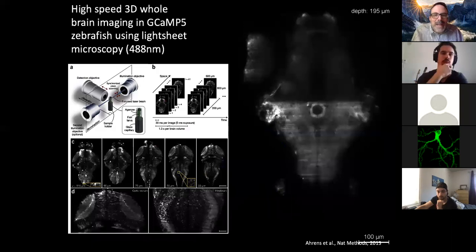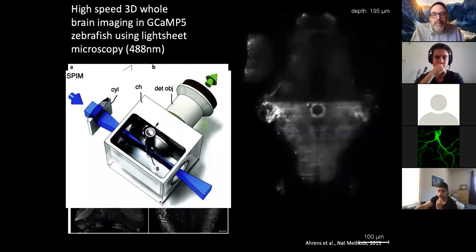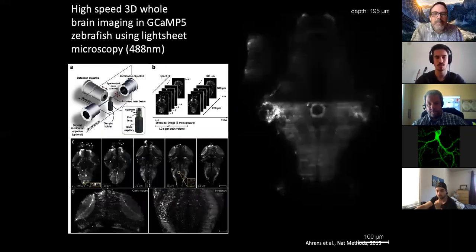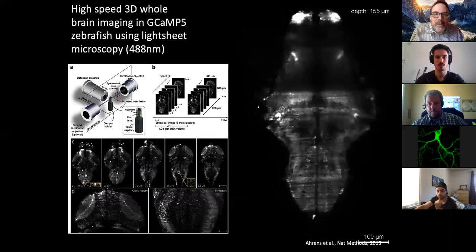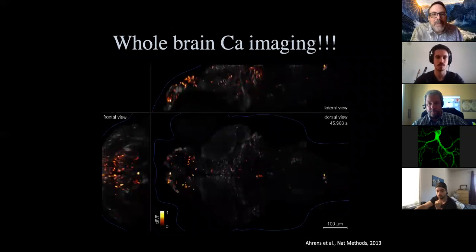And of course, the classic image, the mandatory image for a presentation on this kind of method, is the work from Misha Ahrens, doing whole brain light sheet imaging of GCaMP. I think one of the greatest advantages of a transparent model like this is that you really can do whole brain imaging at high temporal resolution. And I really like some of the other approaches that I heard about, the high-low approach, for example, that you guys are doing. Sounds really cool. Rapidly scanning through the brain and generating nice three-dimensional reconstructions of activity.